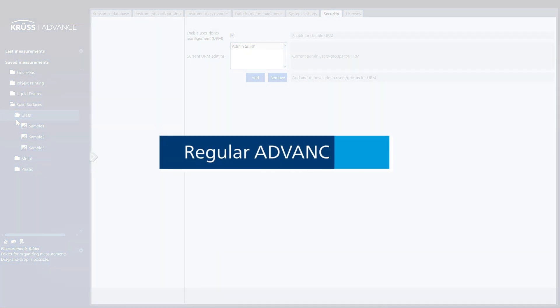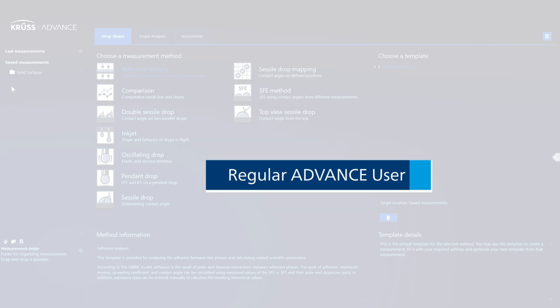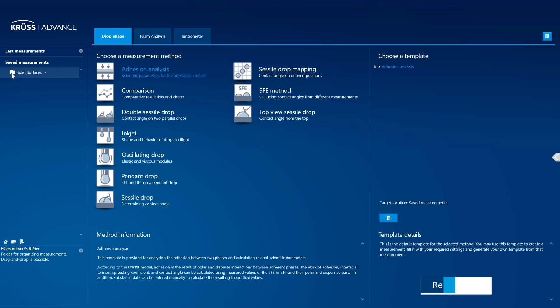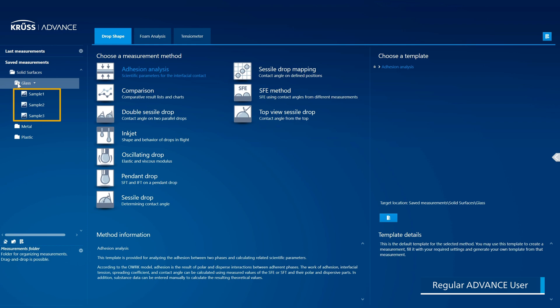We will now switch to the Advanced User view. Every Advanced User has automatic access to the measurements and folders that they have created. You can access further elements if you belong to an authorized user group or if an administrator has assigned you access rights.